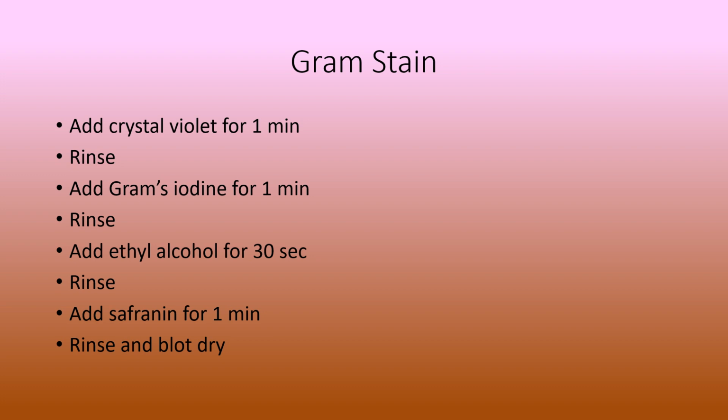Whichever method you use, you're going to rinse it, and then you're going to add safranin. This is a red dye. You add that on for 1 minute, and then you rinse it off with water, and then you're going to blot dry and then view it under the microscope.